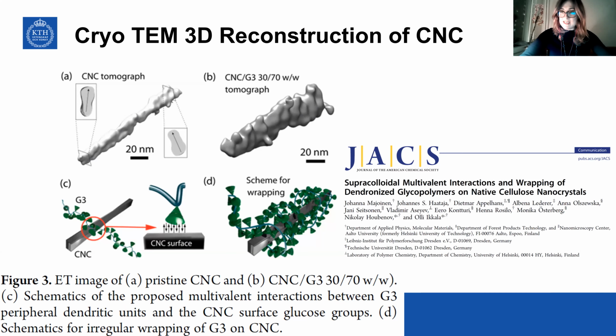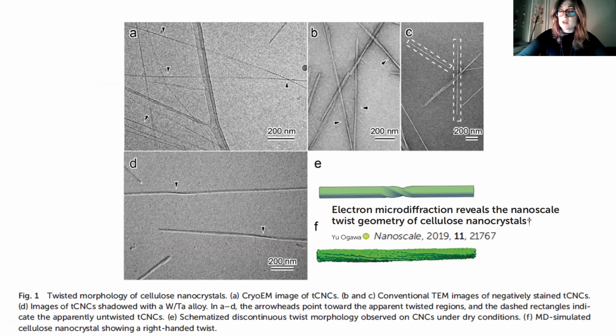Going back to the TEM analysis, besides regular imaging, one can also perform three-dimensional studies, and one can even reconstruct individual fibrils, and that's a methodology which is also highly applicable to the field of proteins and DNA analysis. And besides three-dimensional analysis, one can also do in situ diffraction studies to resolve the inner crystalline structure of the filaments or proteins, for example.